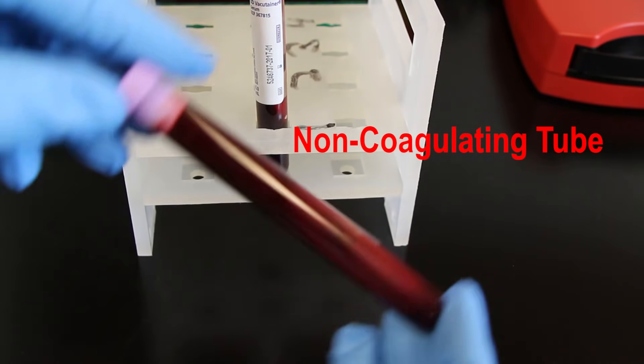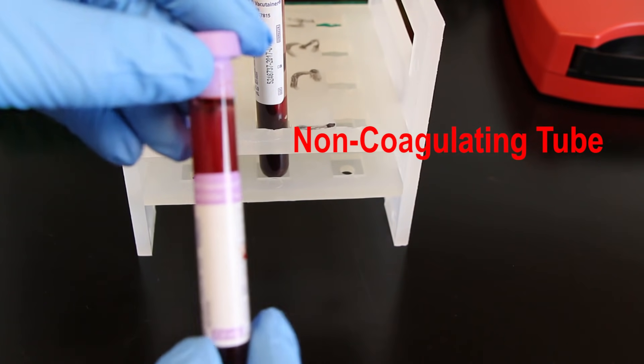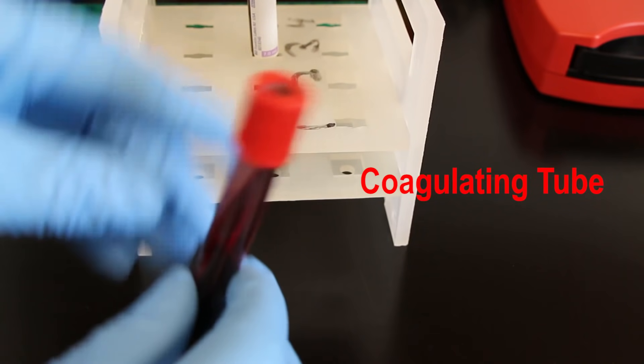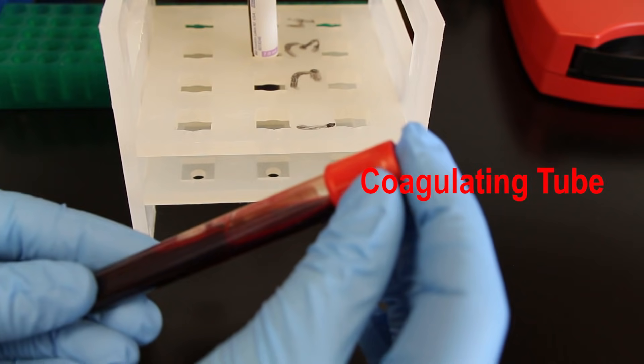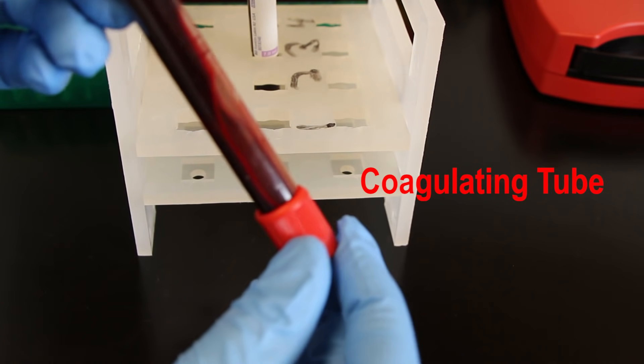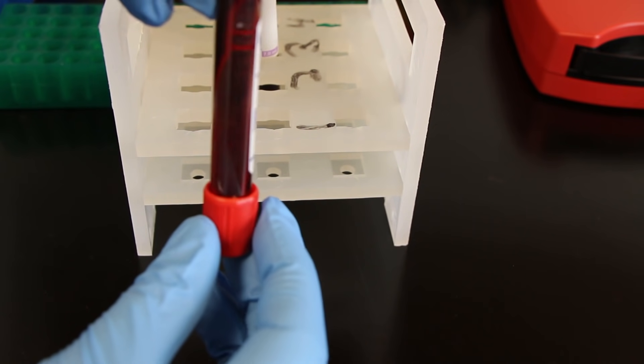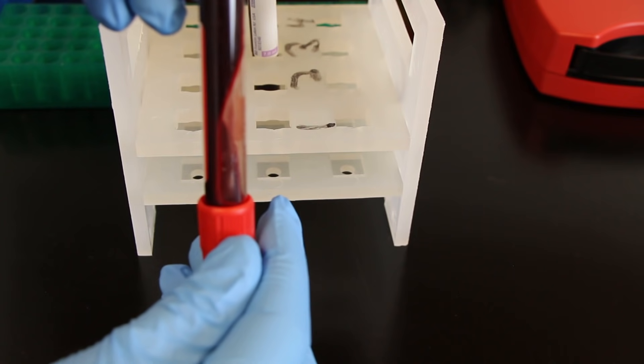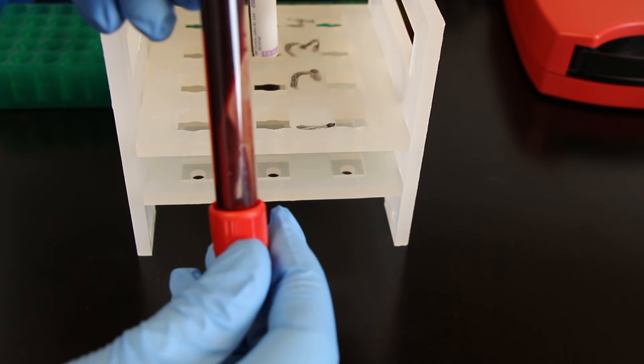One mistake I made that you're going to see in this video is that I forgot to put them in a tube holder. It doesn't really make a big difference, but it makes it hard to tell whether or not the blood has been coagulated because how you tell if blood has been coagulated is you take it and you very gently turn it upside down, and if the blood doesn't move, if it doesn't flow downward, then that means it's coagulated. You can still see that with it being on its side, it's just not quite as clear.